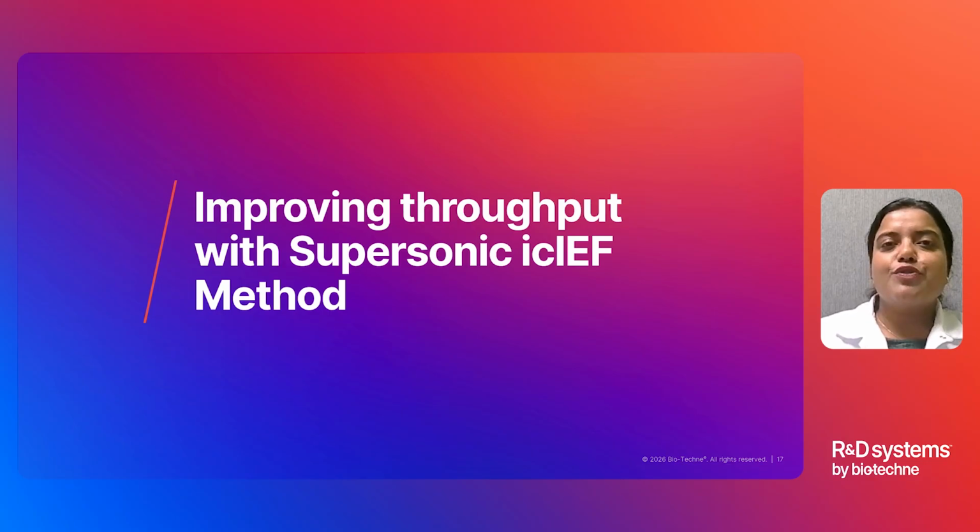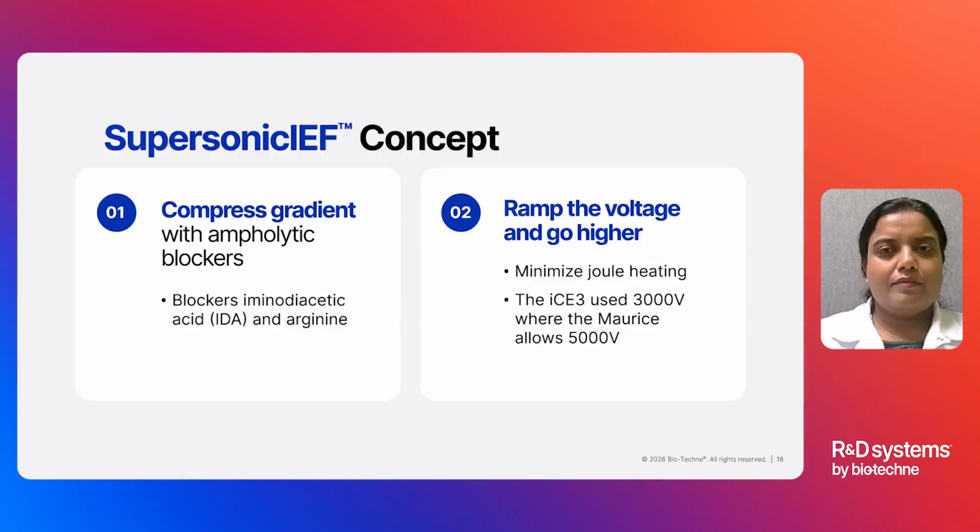And let's start with our supersonic icIEF method. Now, what is this supersonic icIEF method and what's the concept behind it? Supersonic icIEF achieves faster icIEF analysis through two key innovations.